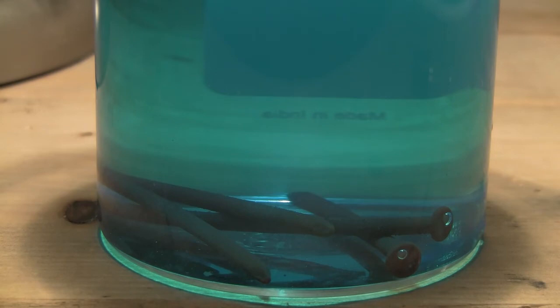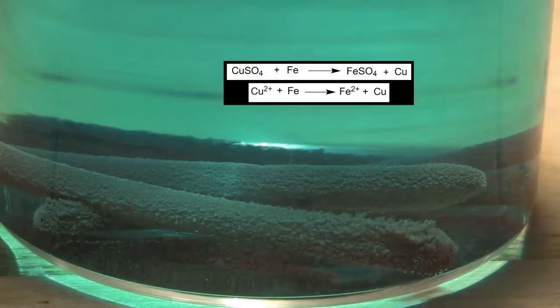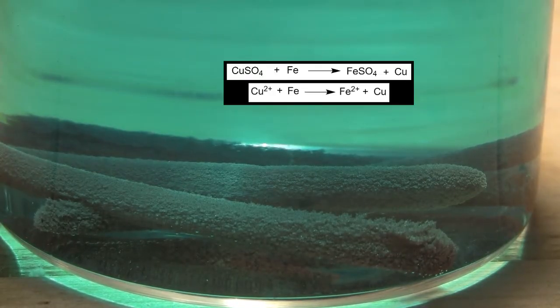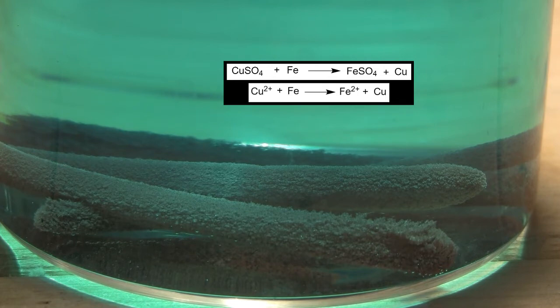The reaction is seen to start by turning the nails a black color before small fluffs of copper crystals start forming. The reaction is occurring as shown here. Copper sulfate, when dissolved, forms copper ions. They react with iron metal in a single displacement reaction to form iron sulfate and copper metal.